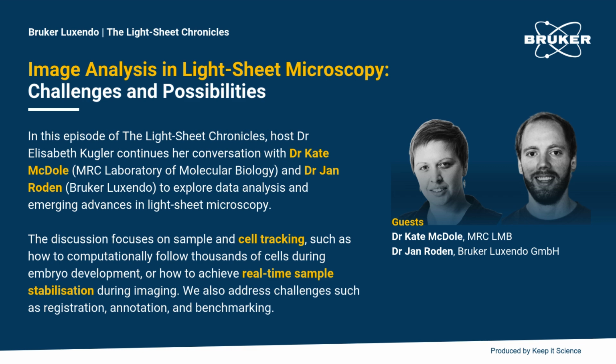Yeah, I unfortunately also don't have a good solution for that either. Otherwise, I would have already suggested something. But it's definitely a big problem. With our microscopes we often try to provide additional data servers, but as Kate pointed out, you always run out of space eventually, right?